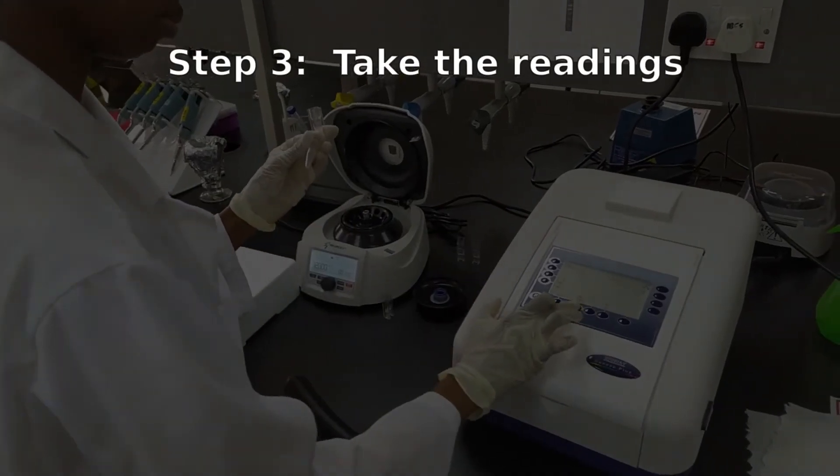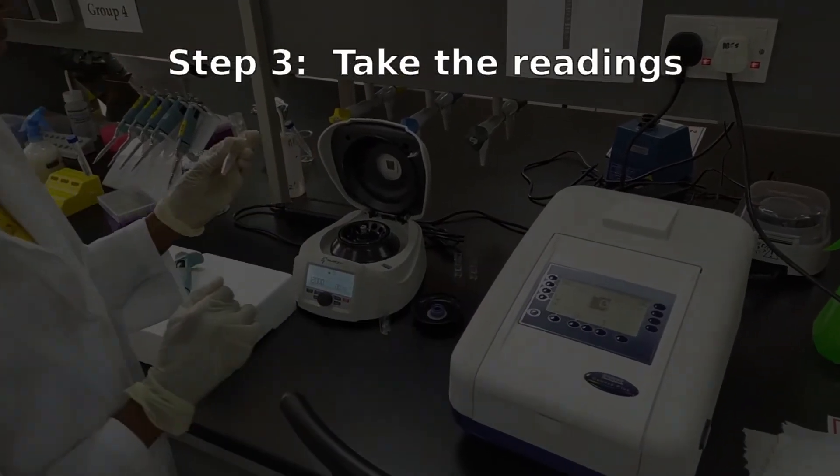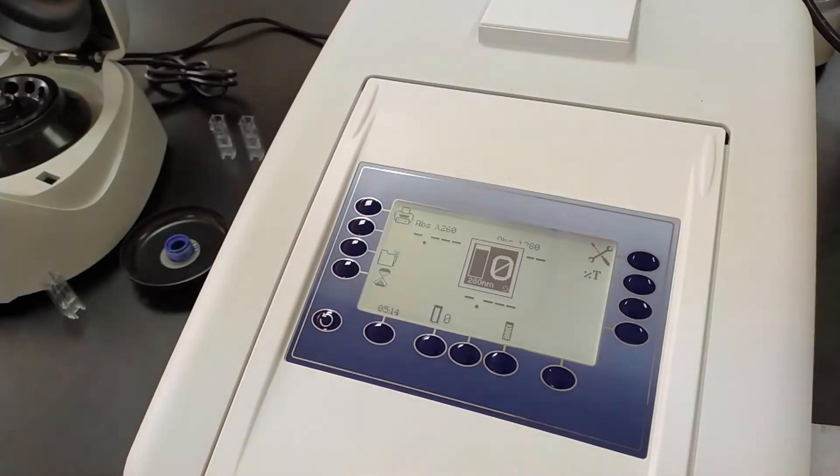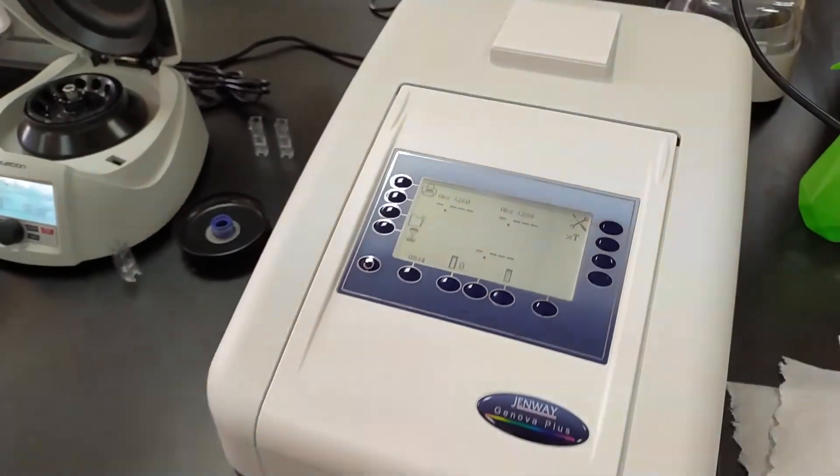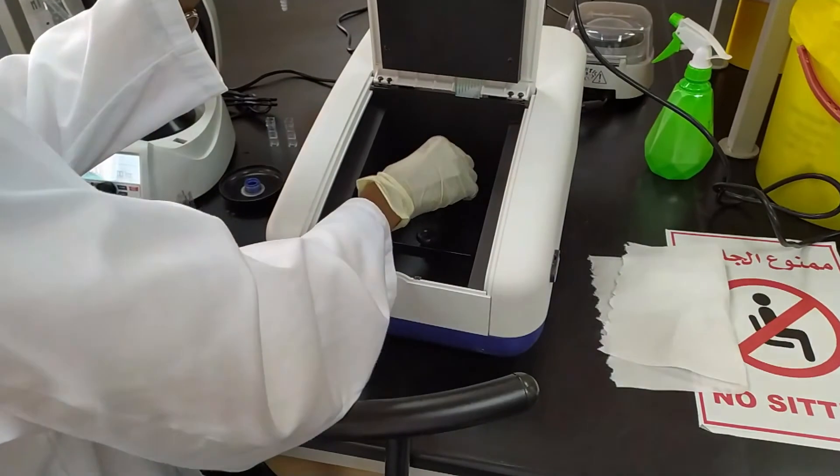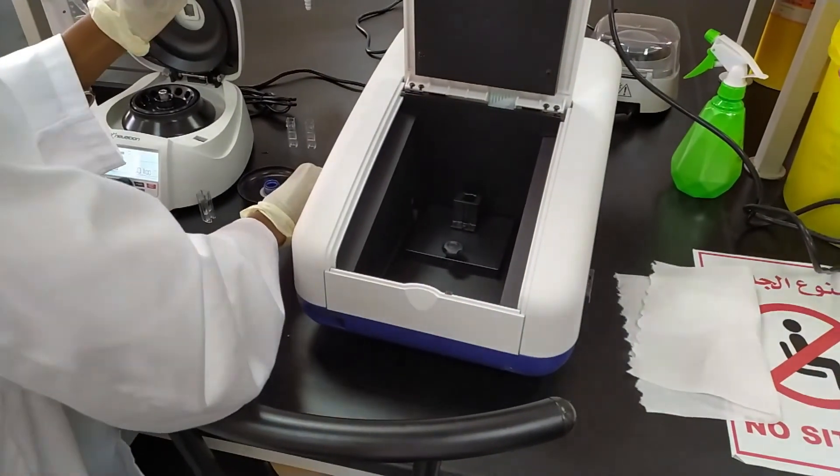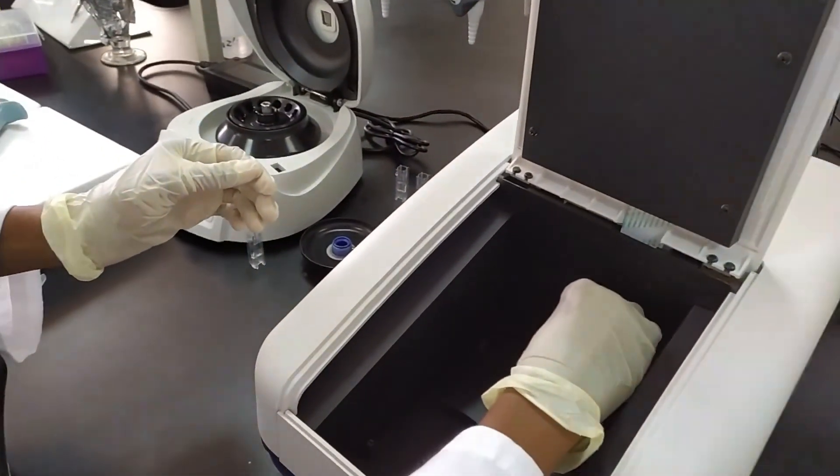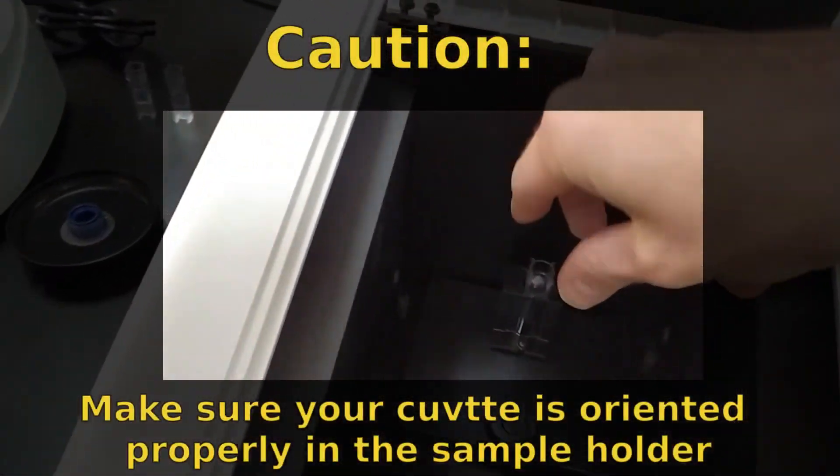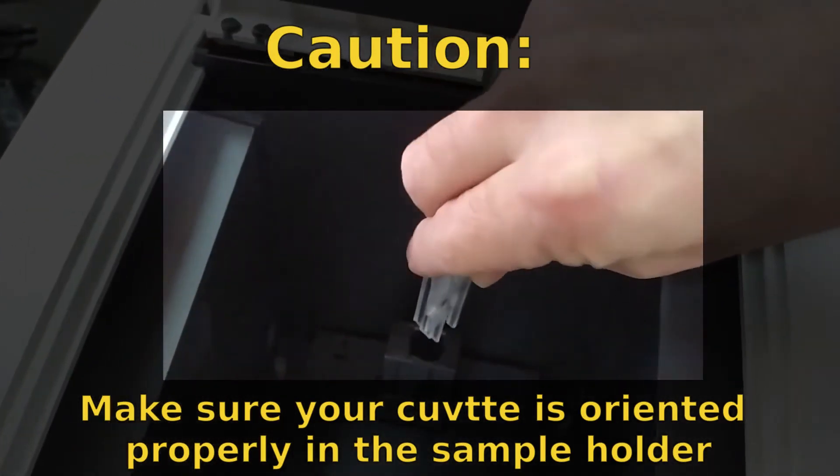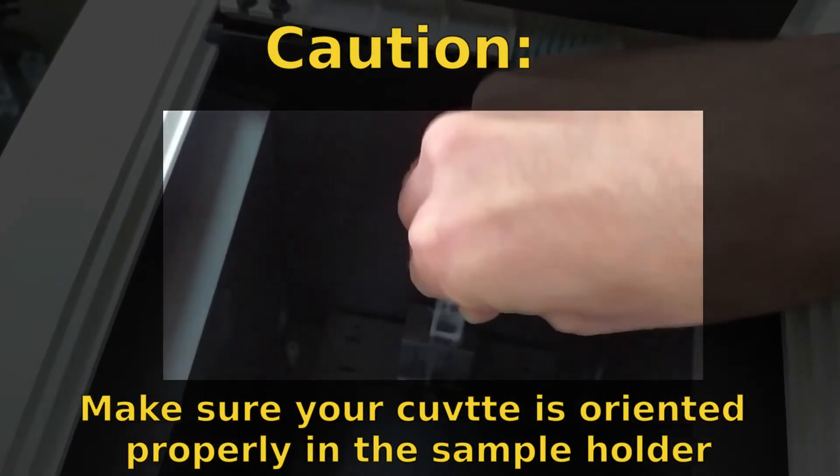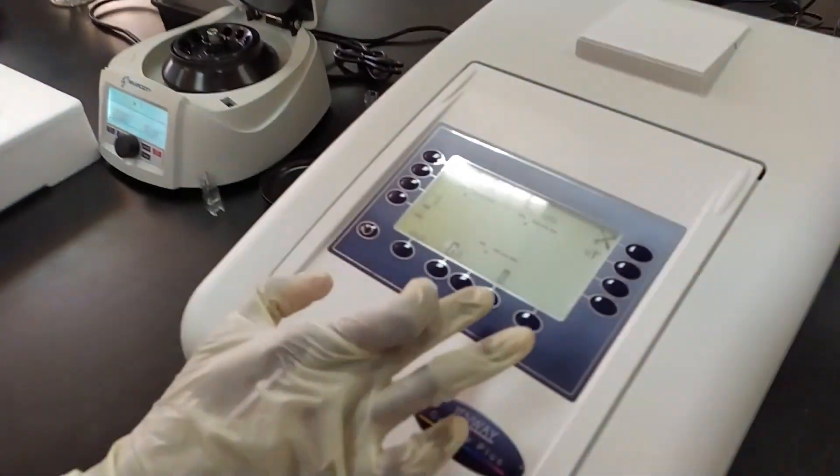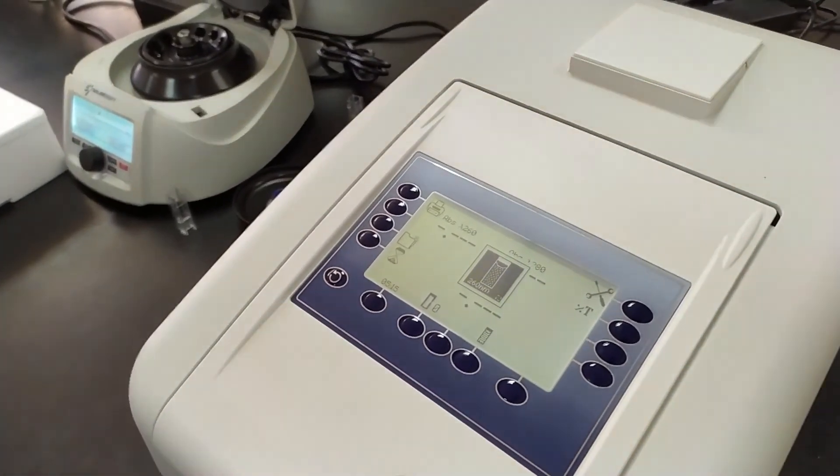So put in the blank, press the blank button on the spectrophotometer, wait for it to take its readings. Then take your blank out and put in your 100-fold dilution into the spectrophotometer. Press the read button and see what numbers it gives you.